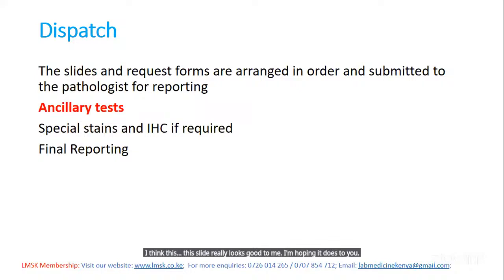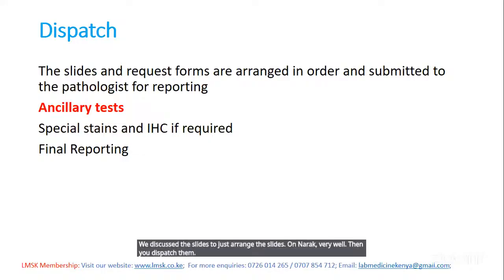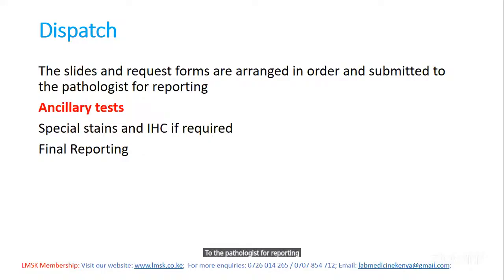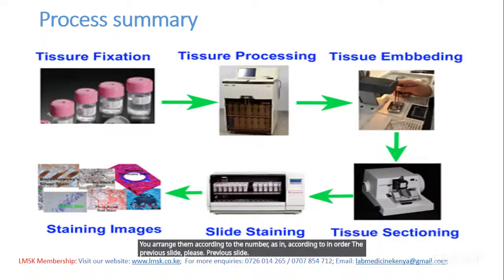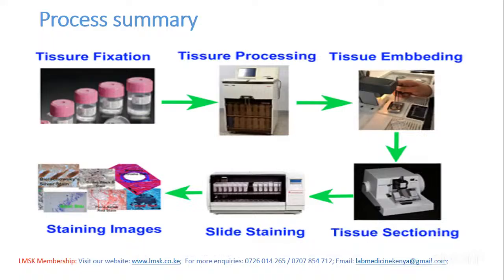Then after this, it's time for you to dispatch the slides. You just arrange the slides on a rack very well. Then you dispatch them to the pathologist for reporting. You arrange them according to the number, in order. The previous slide, please. Previous slide. You arrange the slides, then you dispatch them to the pathologist for reporting.